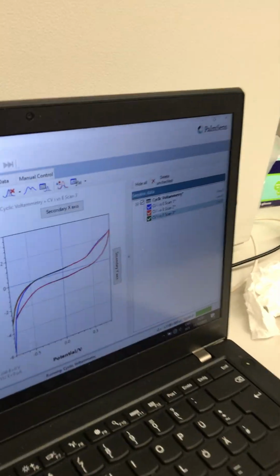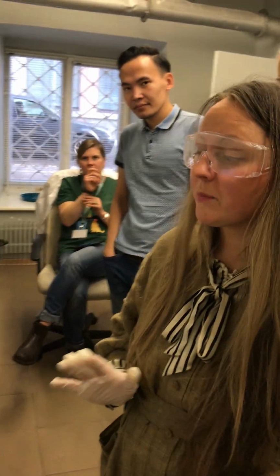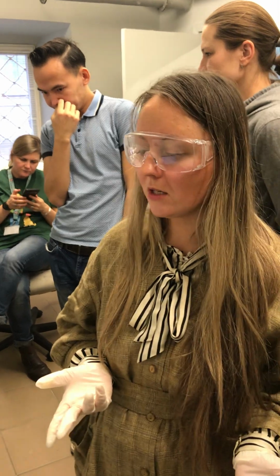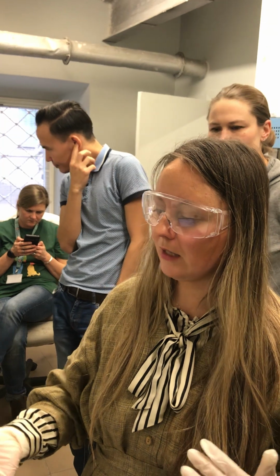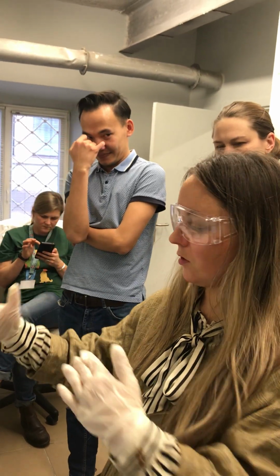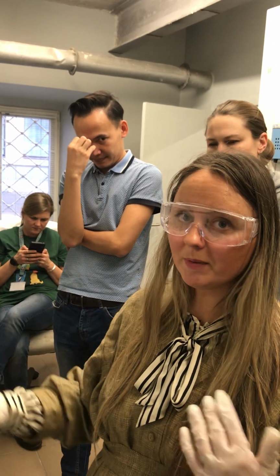I see. And the CSV files are separate for each file? Yes. How do they look? This is another topic we can discuss later. You could export the data in such a way, you can script it even here, you see the script. The way to analyze data is up to how you like it. It can be exported in the same file from different experiments, or it can be separated, exporting one by one. Also you can do coding by timing, having a gap: you measure for 1 minute, or you wait for 20 minutes, then you measure again, you repeat the cycle, you can make loops.